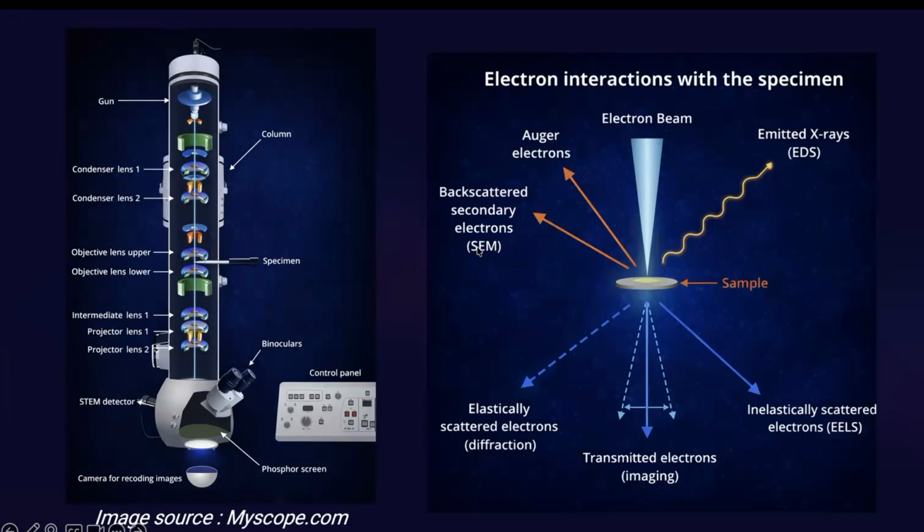In this case, unlike the secondary electron, what we see is the electron beam passing through. As you can see, the instrument itself looks very complex. A beam of electrons hits your sample and then transmits. That means your sample has to be electron transparent, very thin. And when a beam of electrons interacts with the sample, many different phenomena are possible. Light is emitted, X-rays, other electrons, backscattered electrons. This is where we can do scanning transmission electron microscopy, called STEM.